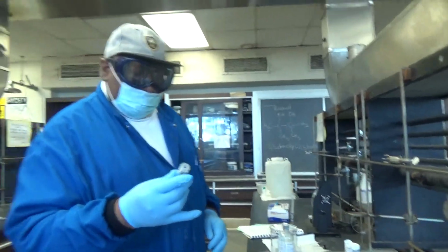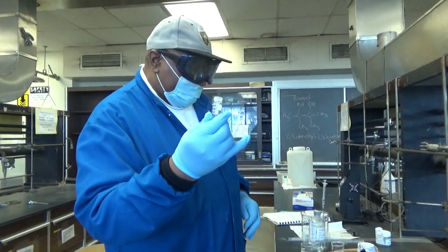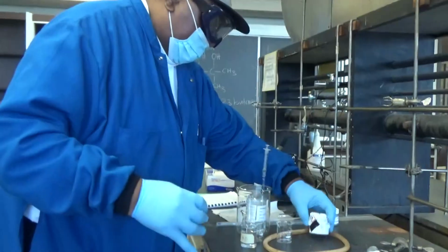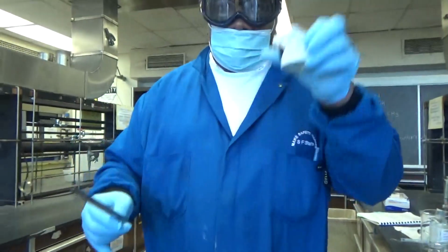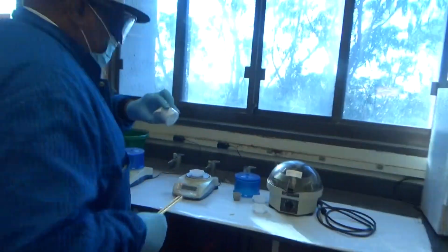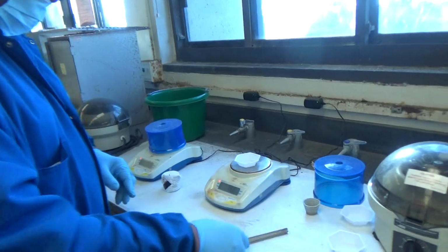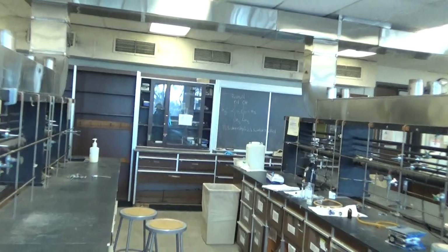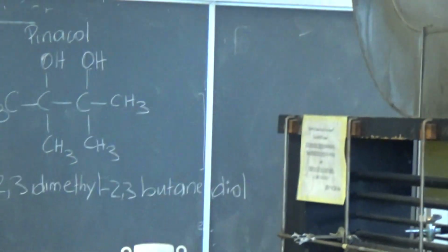Now we are going to first fill the conical flask. So we need to go to the balance and measure some pinacol. It's a solid, as you can see here. A lot of alcohols are liquids, but this is a weird one, because it's a diol. Like ethanol, propanol, butanol, almost every alcohol I know is a liquid. This one's a weird solid.